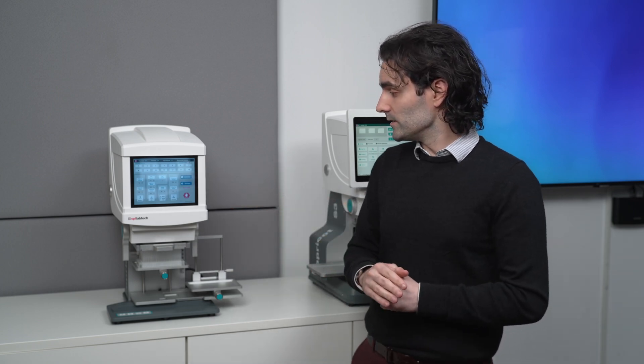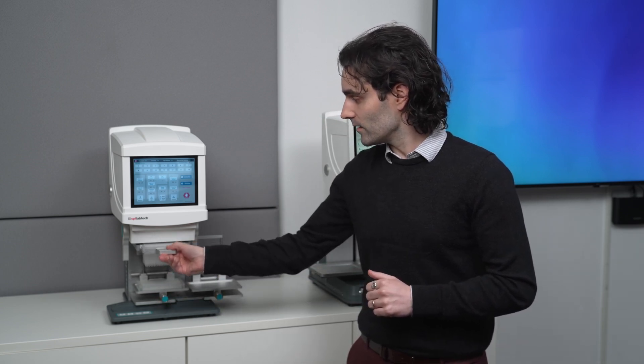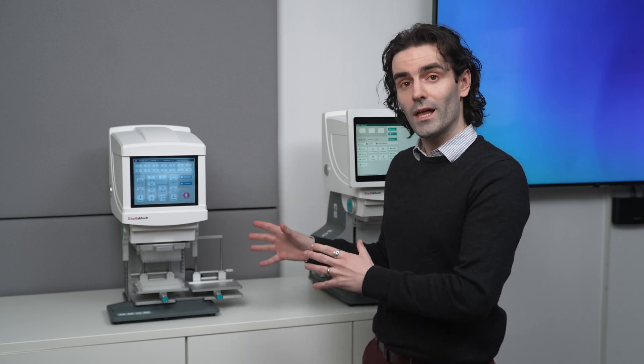With this instrument, you use a tip loading system called Easy Load, so we can easily unload and reload our tips. You can work in 96 and 384 well plates, and you can work either in full head pipetting or in columns if you're doing something like a serial dilution. This instrument is great if you're new to automation or if you're interested in just automating a quick and simple liquid handling task — you might be doing an addition to a plate, stamping out multiple plates, or a serial dilution.